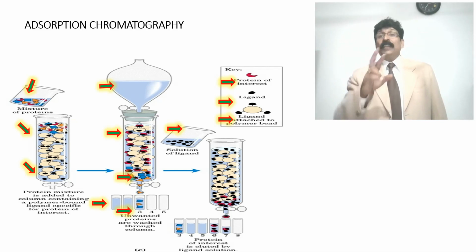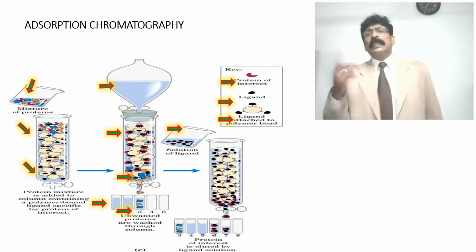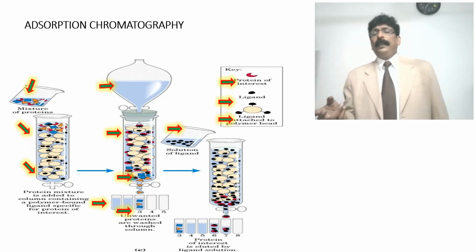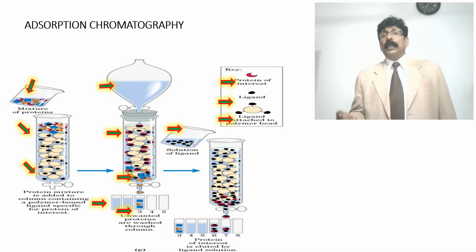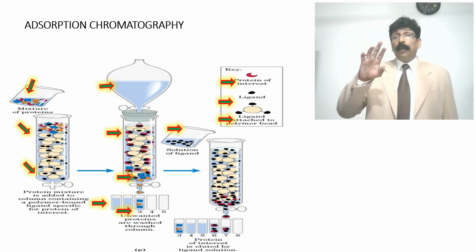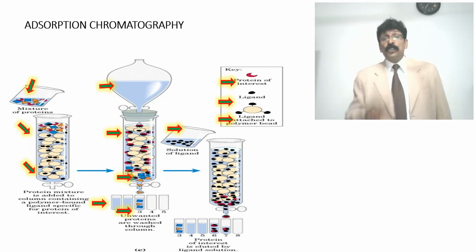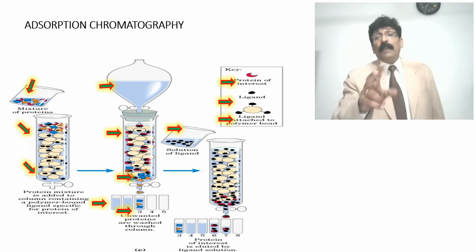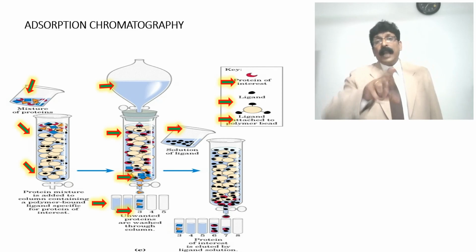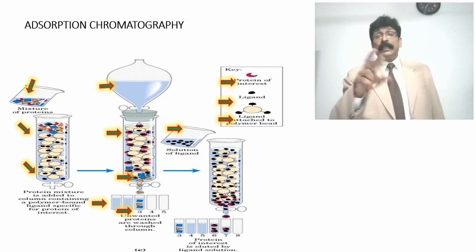So you are changing the mobile phase. So this you will do in other systems also. You will increase the polarity. You will change, that is, isocratic solvent system, or you can say that is many solvents, increasing polarity also can be used. So this solvent system, here the solvent we are using is the solution of the ligand which you are using in the next step.